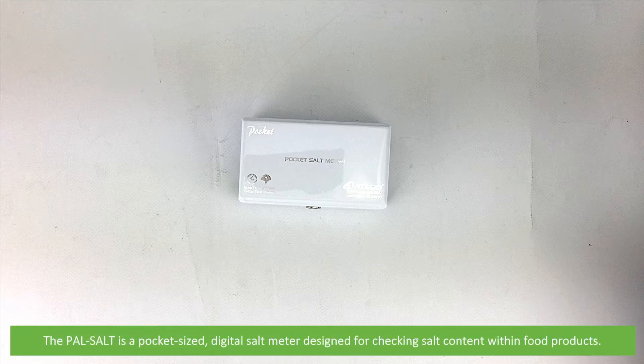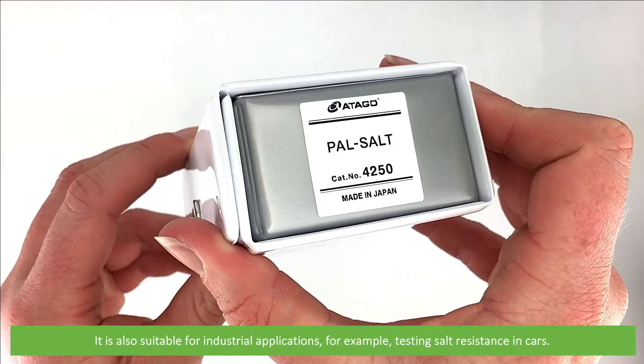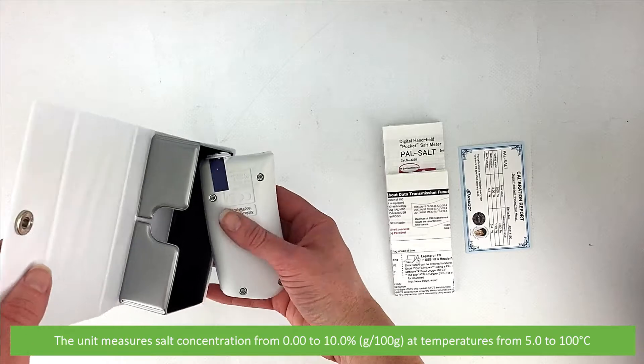The PALSALT is a pocket-sized digital salt meter designed for checking salt content within food products. It is also suitable for industrial applications, for example testing salt resistance in cars. The unit measures salt concentration from 0-10% at temperatures from 5-100 degrees Celsius.